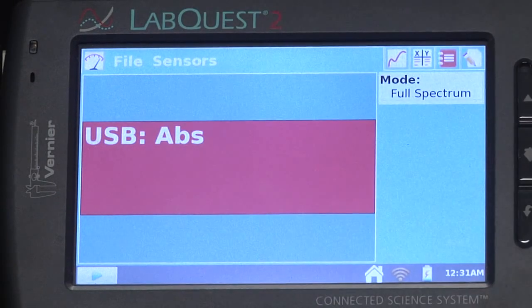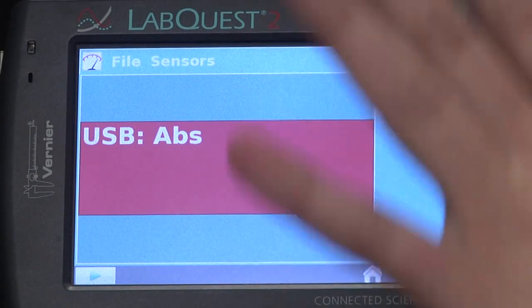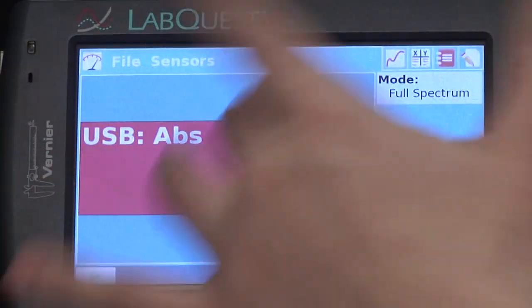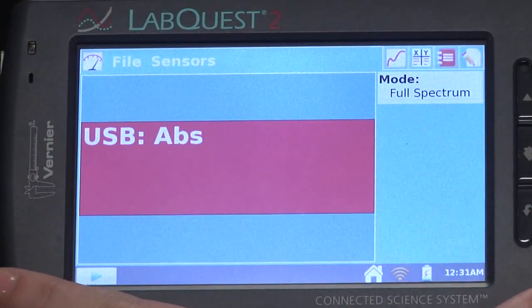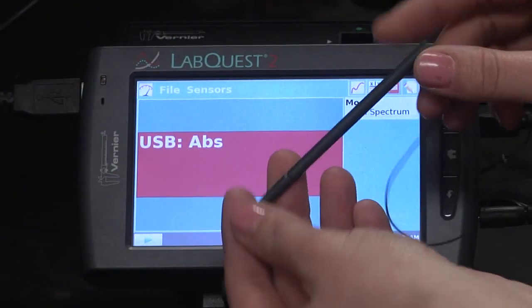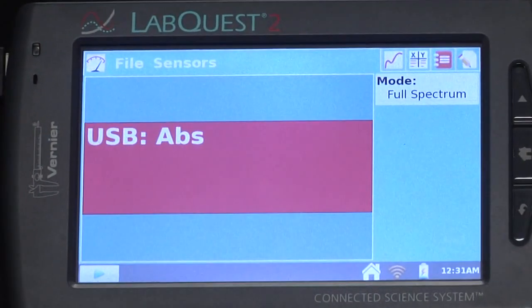Now that we have it all plugged in and powered up, you can use your fingers to do anything that I'm talking about, or for more precise movements you'll want to use your stylus. It's just below the battery port.